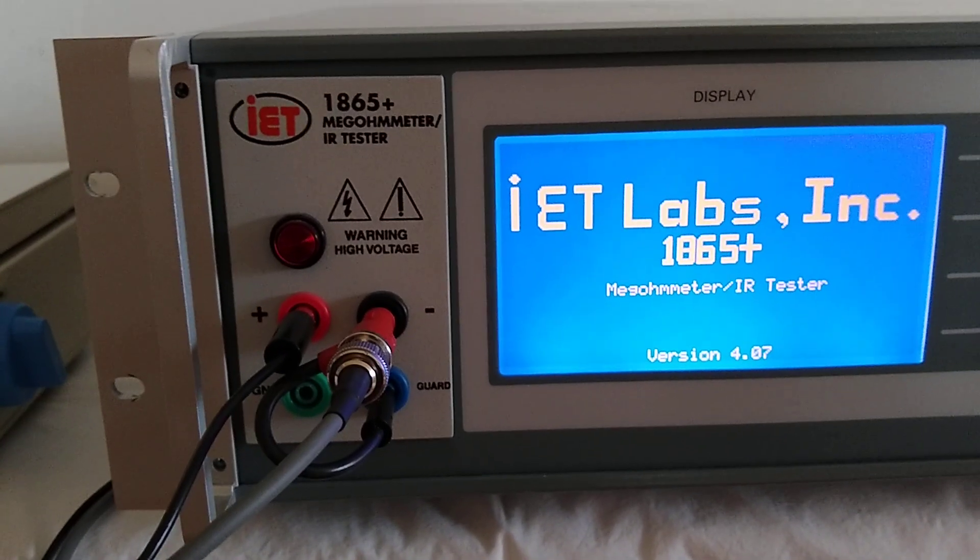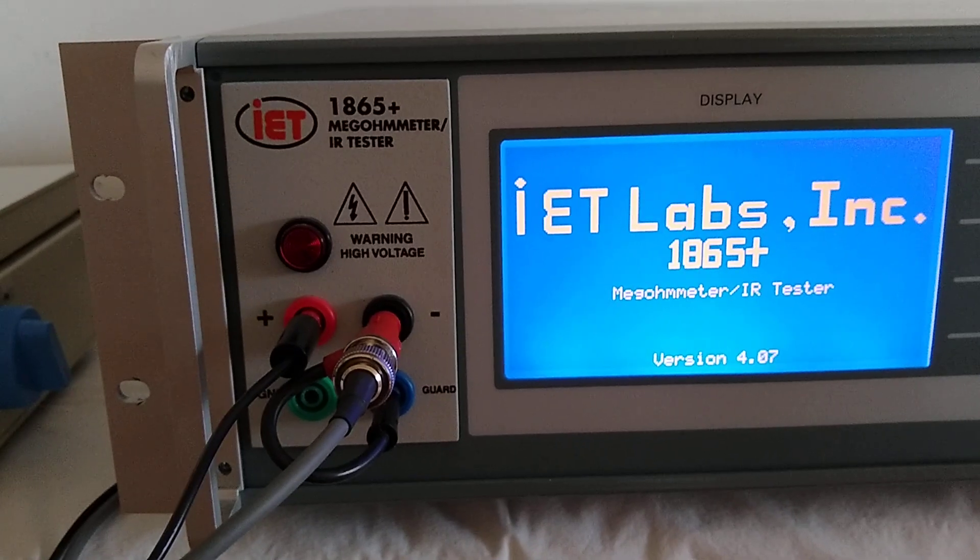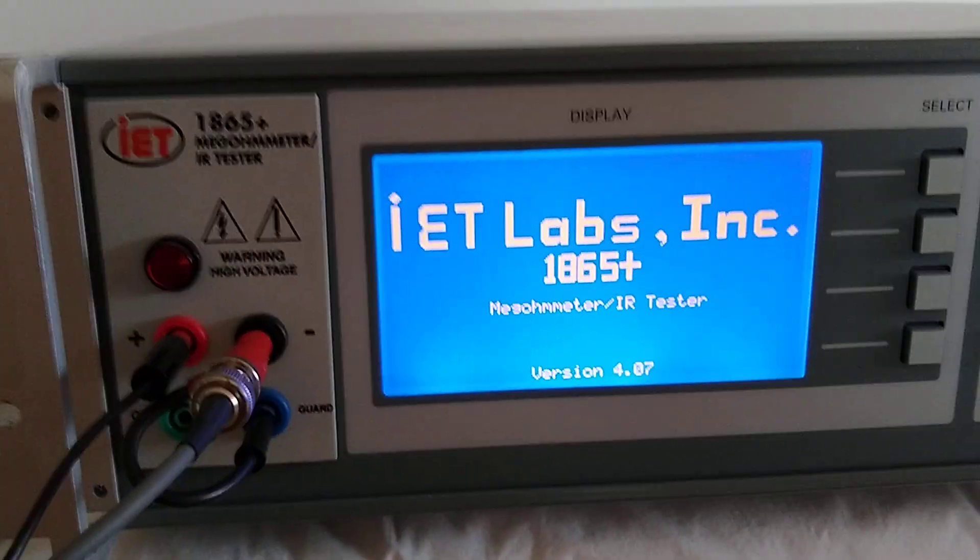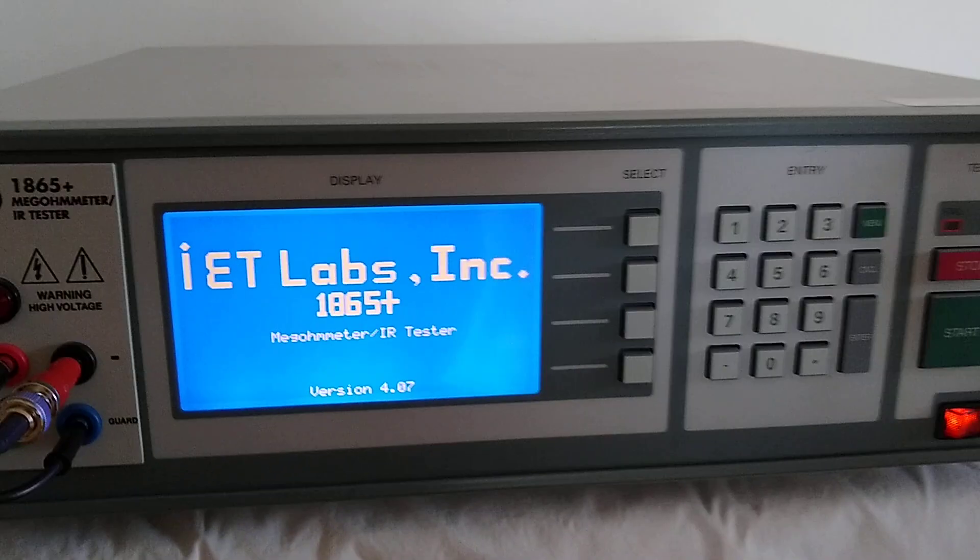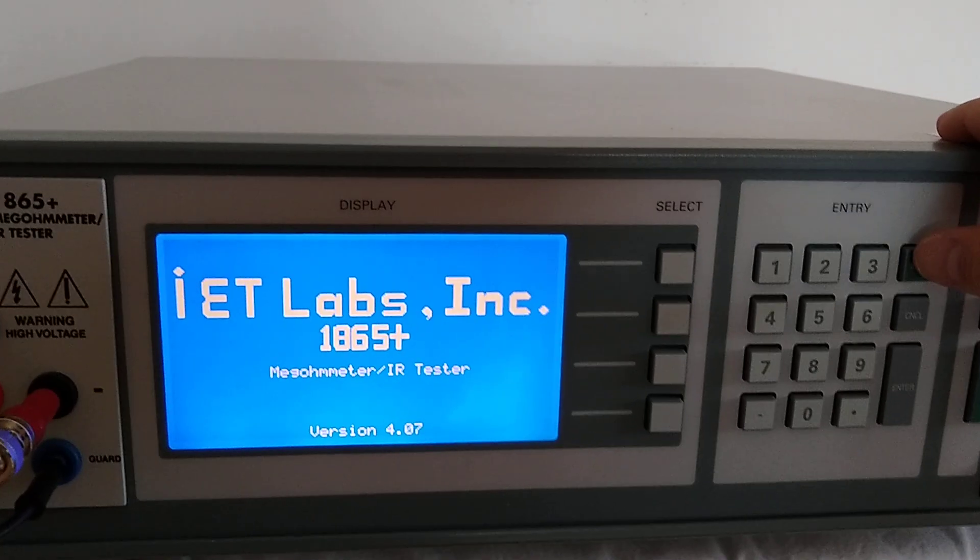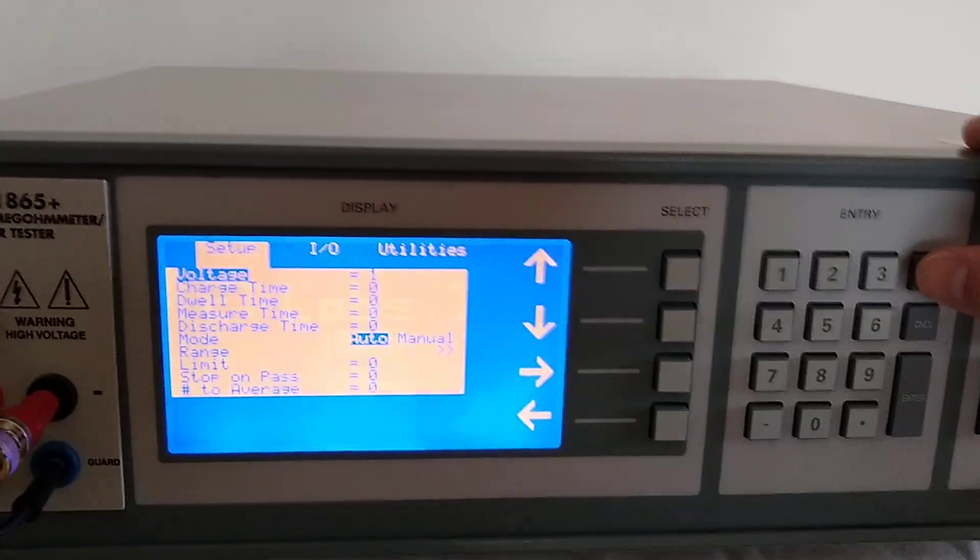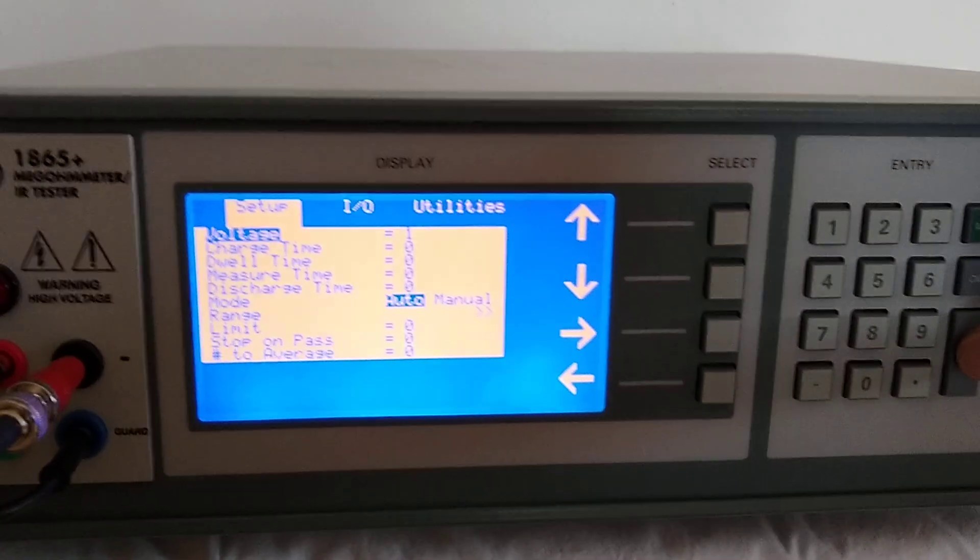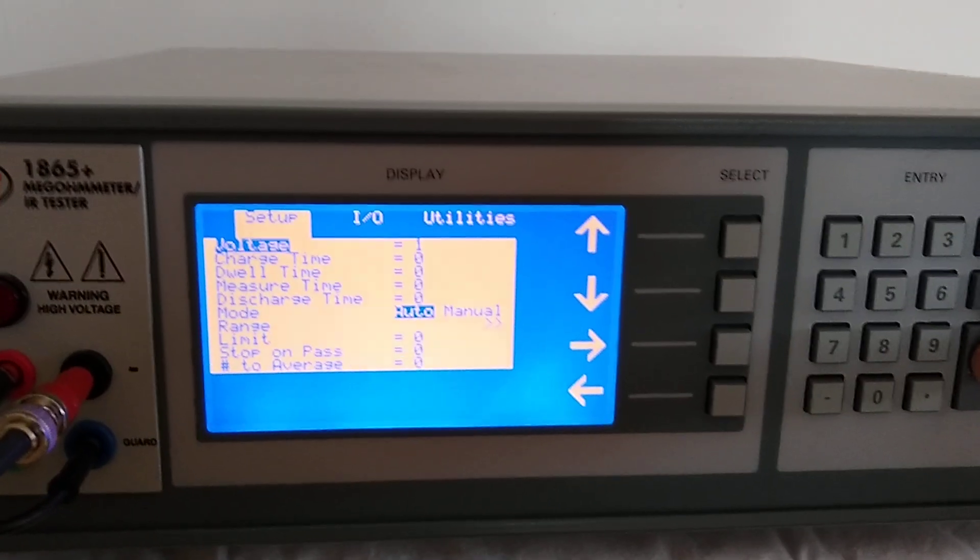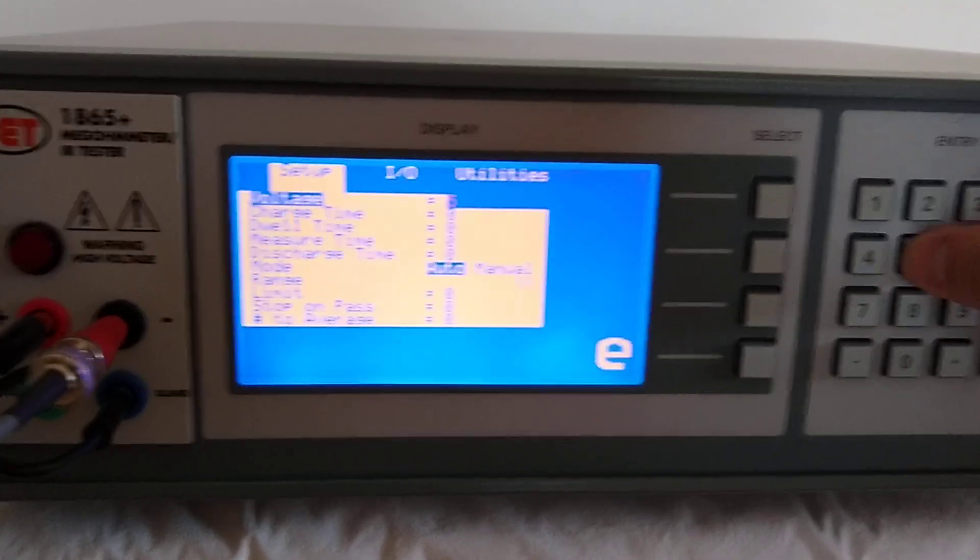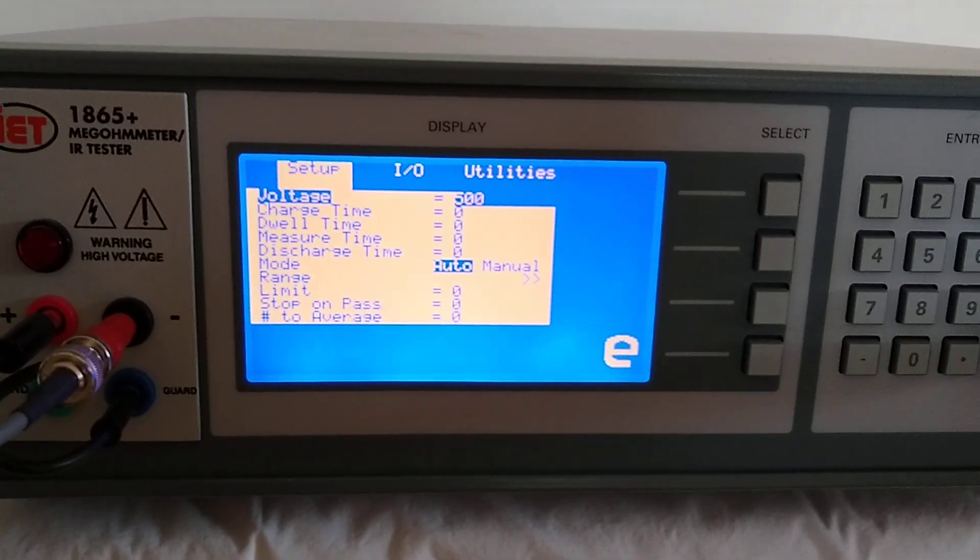So that's in terms of how they're basically connected together. Once you've done that on the 1865 Plus, you can press the menu key, select the voltage that you'd like to test at, in this particular case, 500.